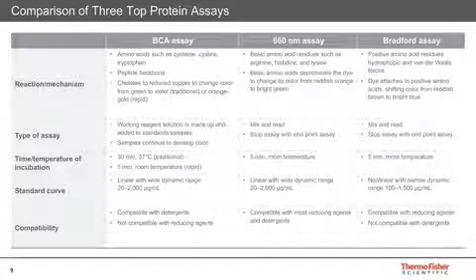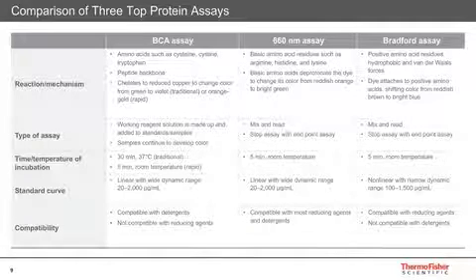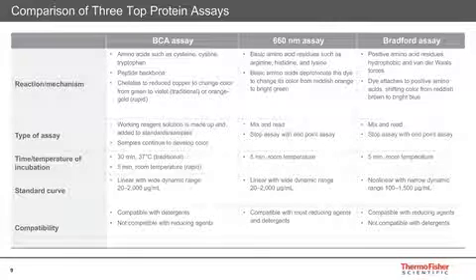I'm going to go in this slide from left to right to compare each assay across each parameter. The parameters that I'm going to talk about here are reaction mechanism, the type of assay, the time and temperature of incubation for each assay, the standard curve, and then the compatibility.